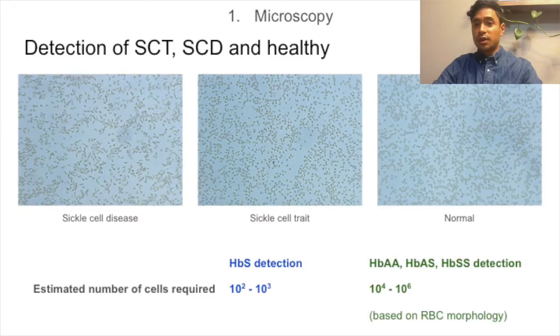Some images from a conventional microscope at the hospital are shown. Note that these images do not have the spherical aberration that was seen in previous images.